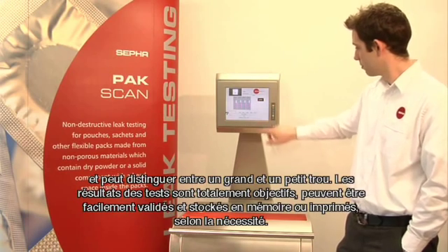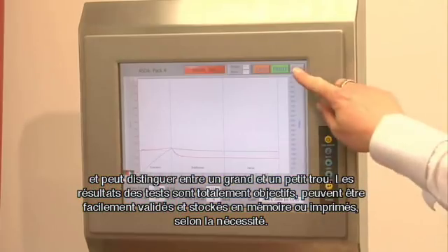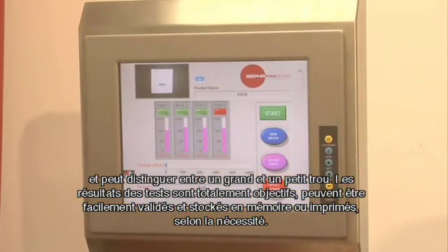The test results are non-subjective, can be easily validated and stored or printed out as required.